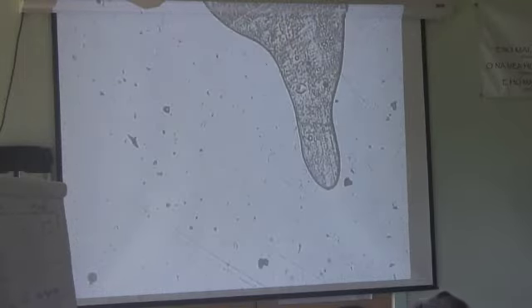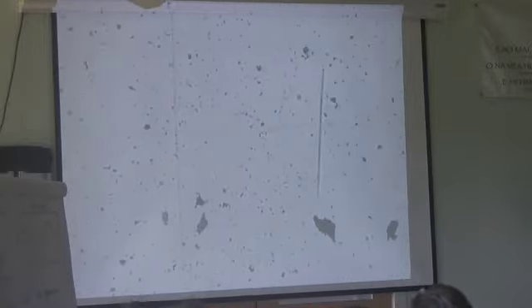Street for the 40. So I just don't think that makes that much difference. If you ever think you might want to do some staining, you might keep it. Do you really have to be 40 closer? You want the intermediate 10, because you want to focus your condenser. Yeah, 4 and 10, and 40. Here's a 10, so there's a 4, a 10, and a 40, and a 100. We just don't need to use the 100, because we're looking at all of these.